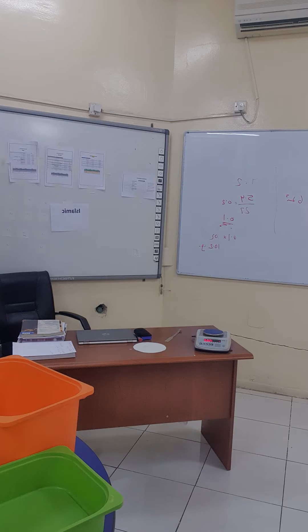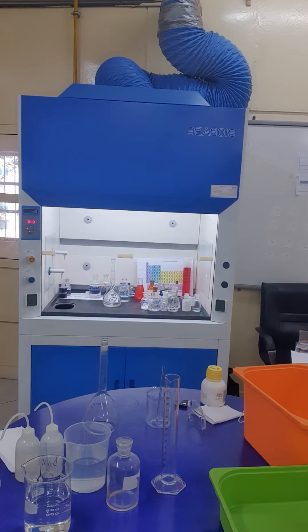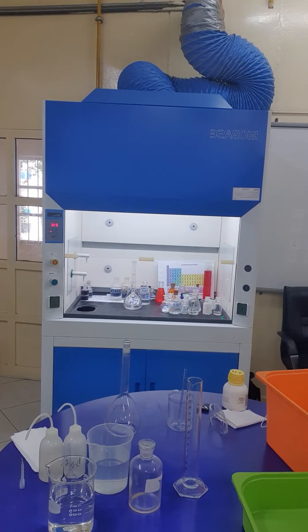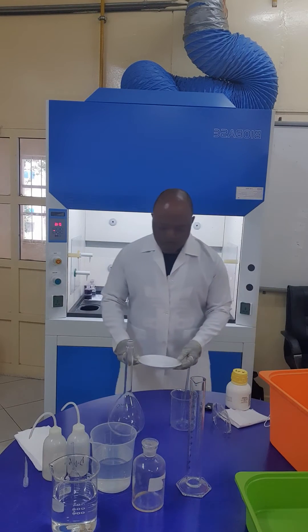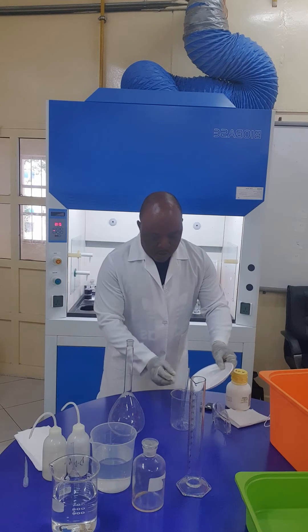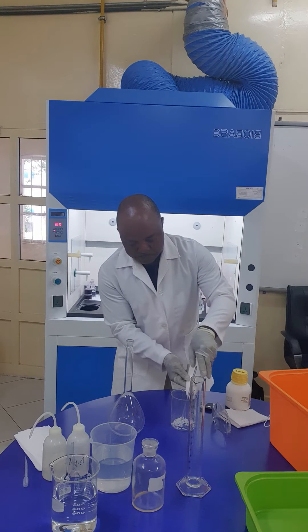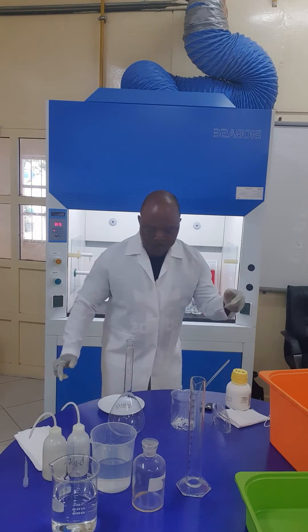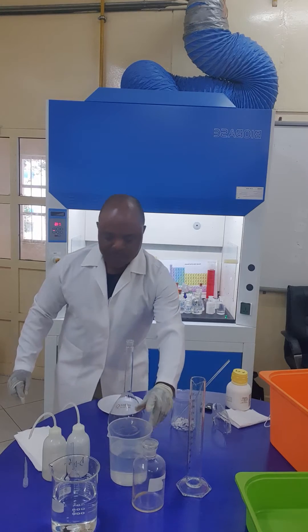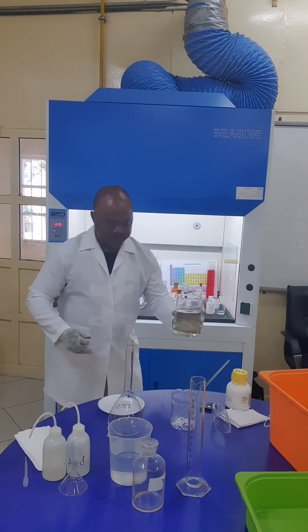What we do is put it into the beaker. Then we put in about 500 ml of deionized water.